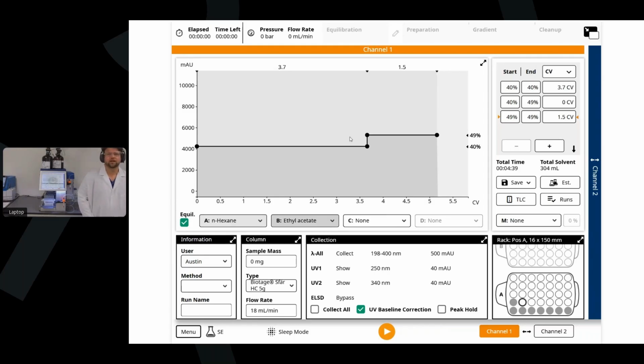If you're seeing that, I would definitely check the flow parameters that you're setting it up with. Again, we typically equilibrate with higher flow rates and pressures. Depending on where you're seeing those dry spots, I've seen some at the bottom of the column, which just means that the column needs to be wetted further. As long as the majority of the column is equilibrated and wetted before loading your sample, it should be fine. If you are seeing that, though, feel free to reach out to Simone or me. Maybe we can troubleshoot that a little bit more.